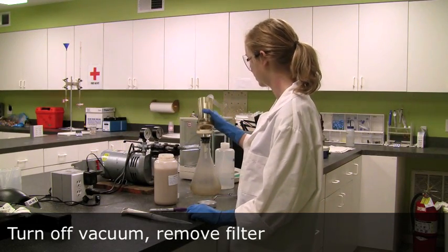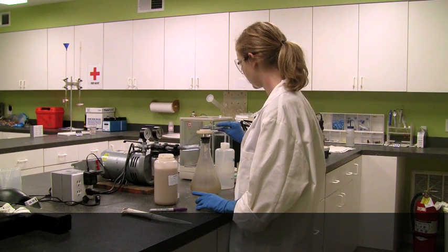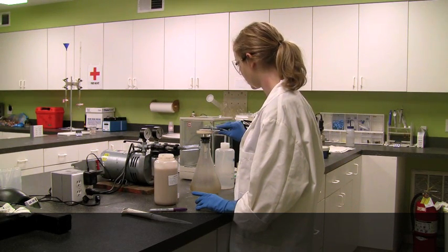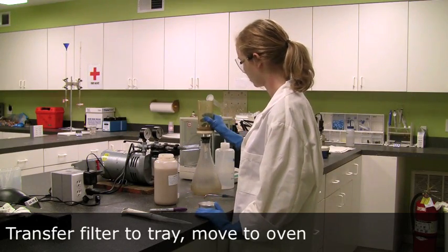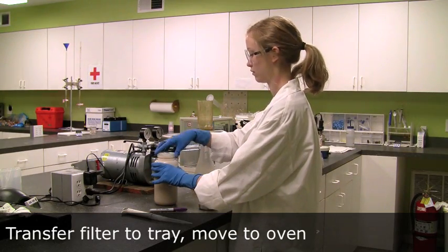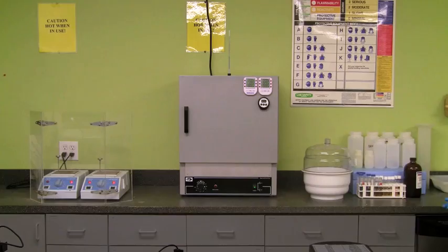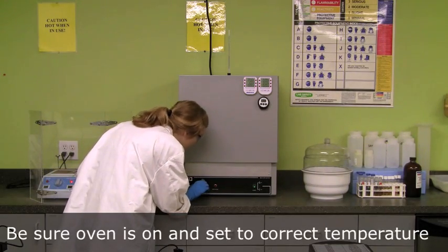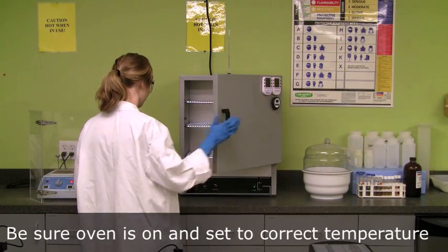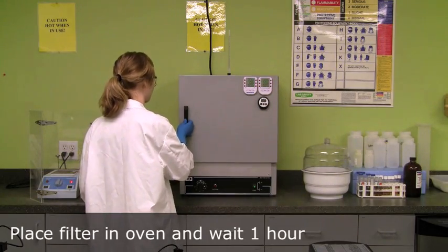Keep the vacuum on until all the liquid has drained through the filter. Remove the filter using tweezers and place it back on the aluminum dish. Place the dish in the oven at 103 to 105 degrees Celsius for one hour.